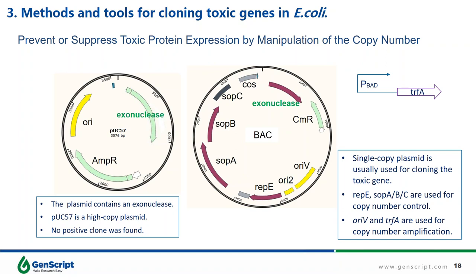I want to show you another case for copy number manipulation. I once received an order for DNA synthesis containing an exonuclease expression cassette. At the beginning, it was cloned into the high copy plasmid pUC57, but it failed — I could not find the correct colonies. Then, this DNA sequence was cloned into a bacterial artificial chromosome vector, which we call BAC. It is a single-copy plasmid usually used for cloning large DNA fragments. I used this backbone for cloning the toxic gene, and it worked — I finally got the correct colonies. This vector can also be used for copy number amplification.